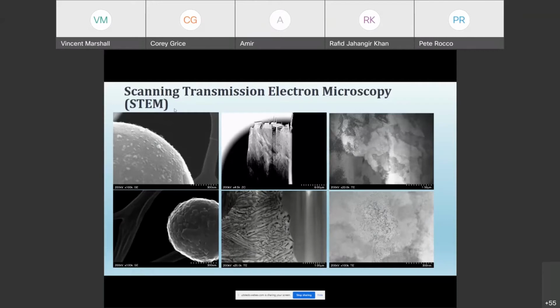You can also use the ion beam to prepare foils of samples. So you can do cutouts of, say, metal samples, ceramics, laminated samples. You can do a number of analyses with that, and then using the TEM you can look at different images. So this is a metal alloy sample that you can see clearly.